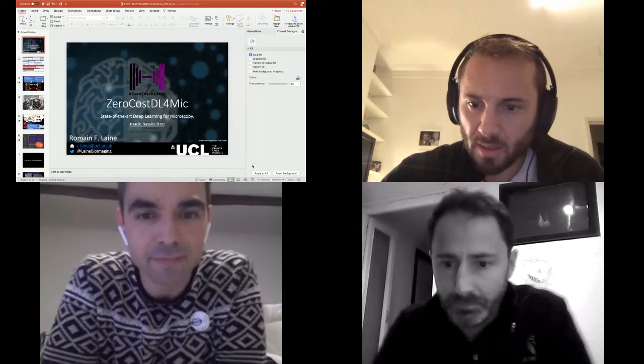I'd like to thank the organizers for having me today. I think it's a great meeting, and I'm really excited to talk right after Ignacio, especially because he's given us an excellent overview of the field, and I can just piggyback on everything that we all know now. So what I'll be presenting to you today is our new platform that we've developed for deep learning applied to microscopy.